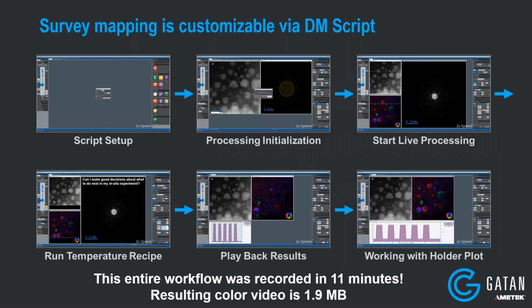And this entire workflow was all one video that I recorded. This whole workflow was recorded in just 11 minutes. So it was very quick and easy to collect this data. And the resulting video is only 1.9 megabytes of data, rather than the over 200 gigabytes that would have been collected if I had collected an in situ 4D STEM data set.